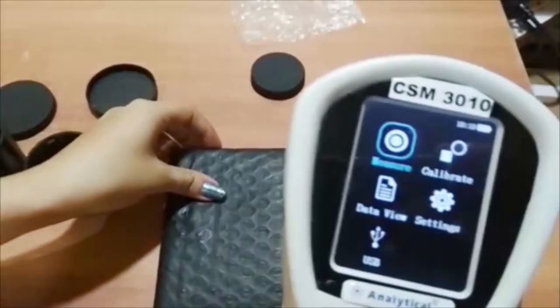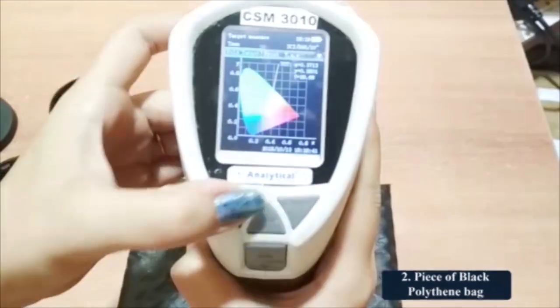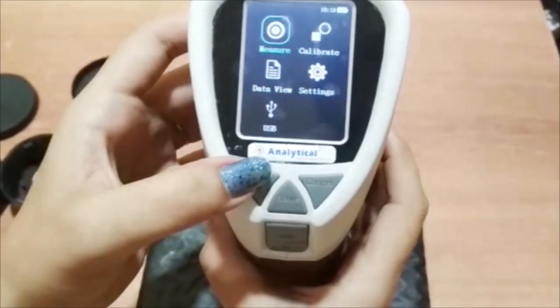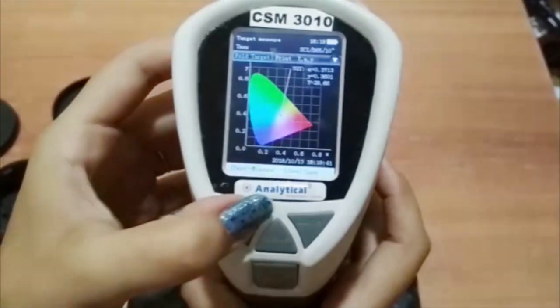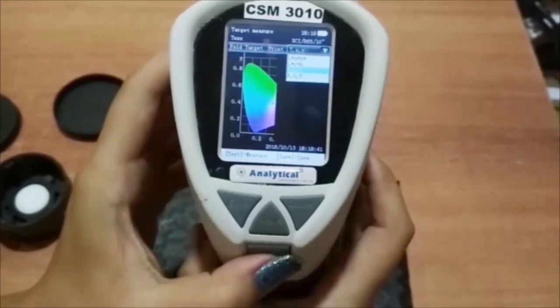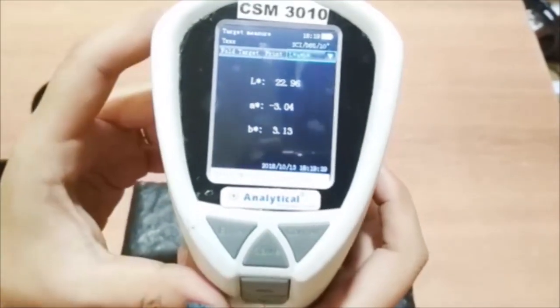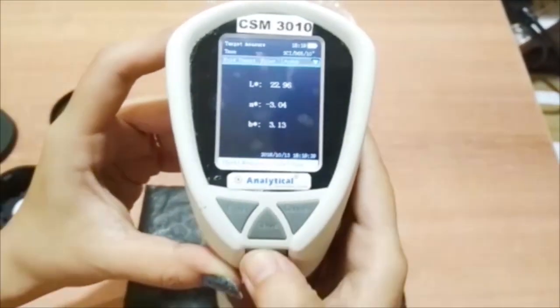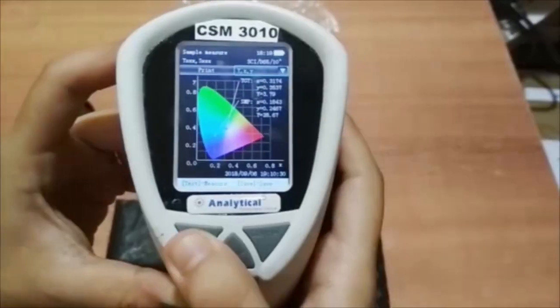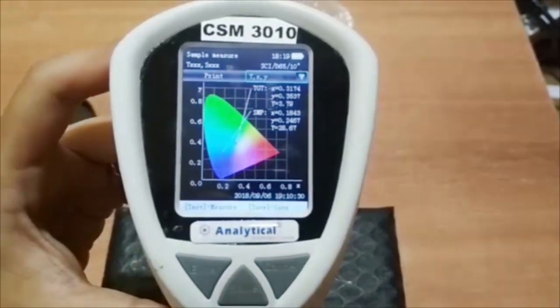Now for a piece of black polythene bag, we can get the same result on screen. This is the profile for white, pink, and black polythene pieces on screen.